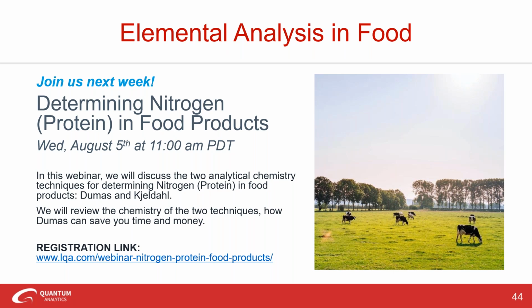Awesome. This is an interesting question. Does your facility need to be licensed to use an X-ray source, like a radioactivity license? You do, and that's state by state. When someone purchases an XRF system, they need to check with their safety commission, the local chapter in their state, and register the serial number of the X-ray tube.